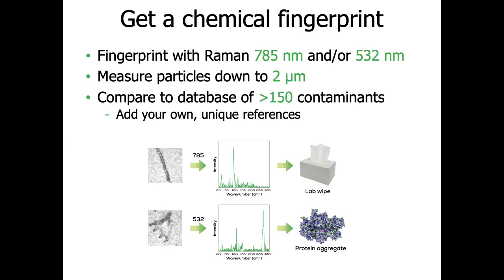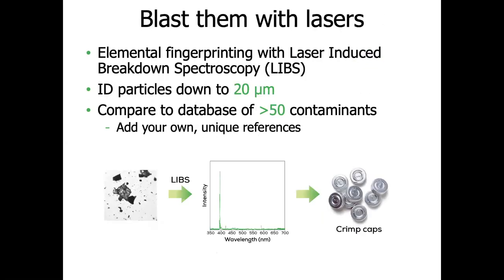Hound uses laser induced breakdown spectroscopy in a similar manner to Raman spectroscopy, but to identify inorganics and metals that can't be identified by Raman. LIBS is an atomic emission spectroscopy where we can apply the same fingerprinting database search we use for Raman — taking an elemental fingerprint and running a Pearson correlation between the reference library and the unknown to come up with a match rank score anywhere from 0 to 1000. With our laser induced breakdown spectroscopy, we can measure particles down to 20 microns. Below you can see an example spectrum of an aluminum crimp cap, where the defining feature is the aluminum atomic emission peak.